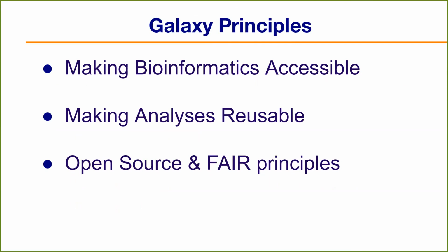The main principles of the project are that we aim to make bioinformatics accessible, both in the sense of making it accessible to those who don't have familiarity with the command line interface, and also by making public resources available. We want to make analyses reusable.